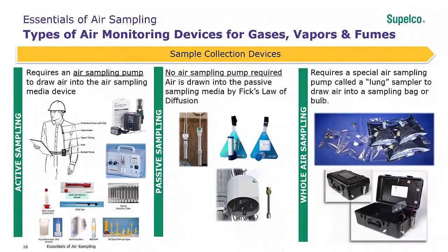As you can see, there are several different devices shown for active and passive sampling. So how do you choose?